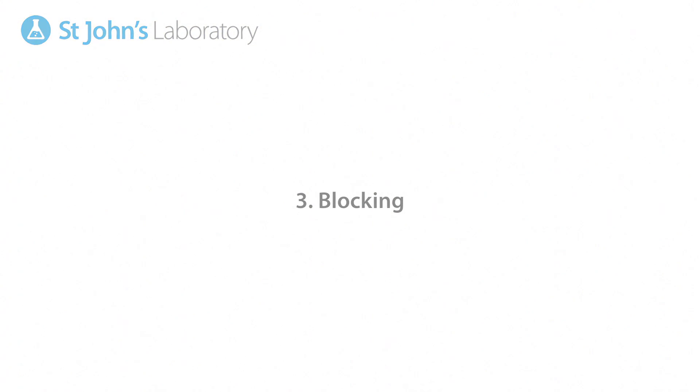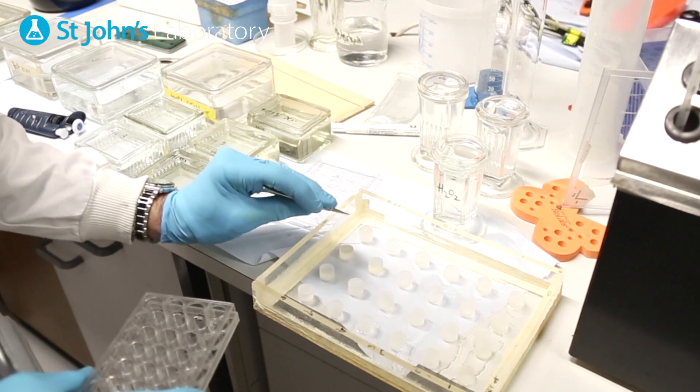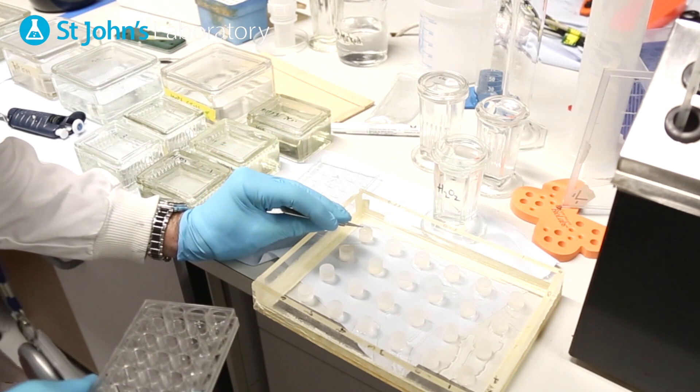Following another rinse with PBS remove each slide from its well and invert onto a humidifier block to expose the cells to 5% BSA in PBS.